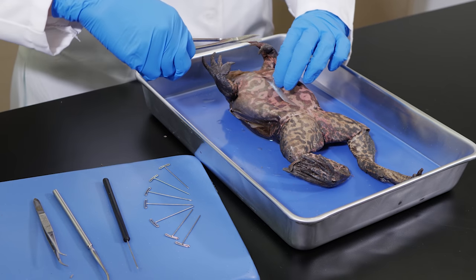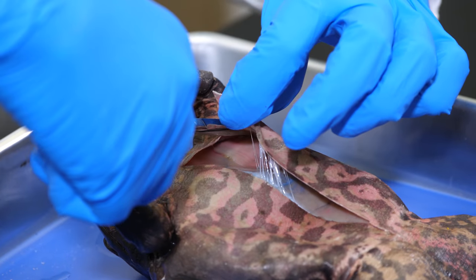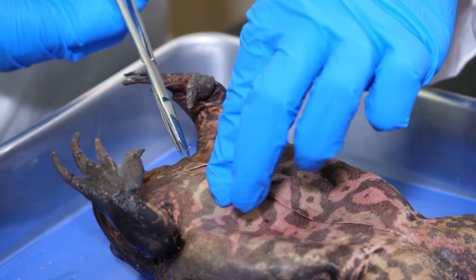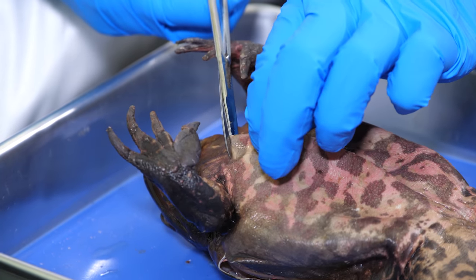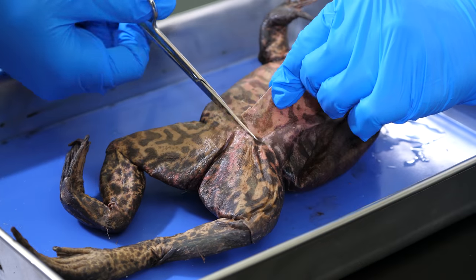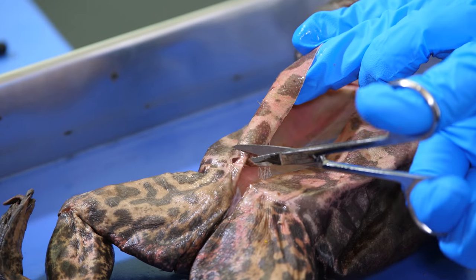Next, we need to make two transverse incisions. The first cut is across the ventral surface, just posterior to the forelegs. And the second cut is just anterior to the hind legs.